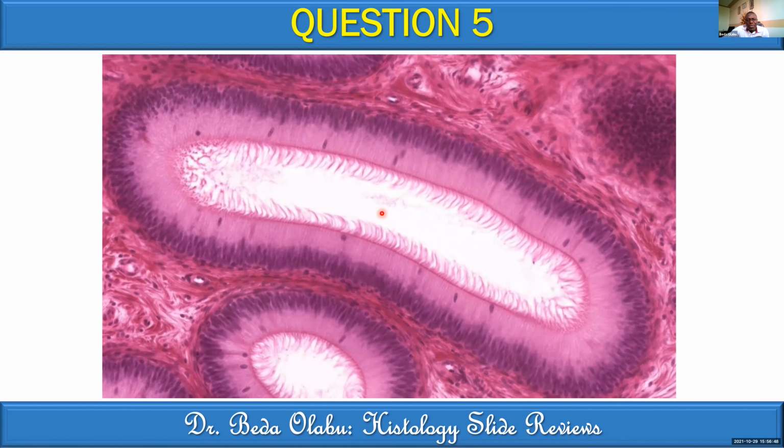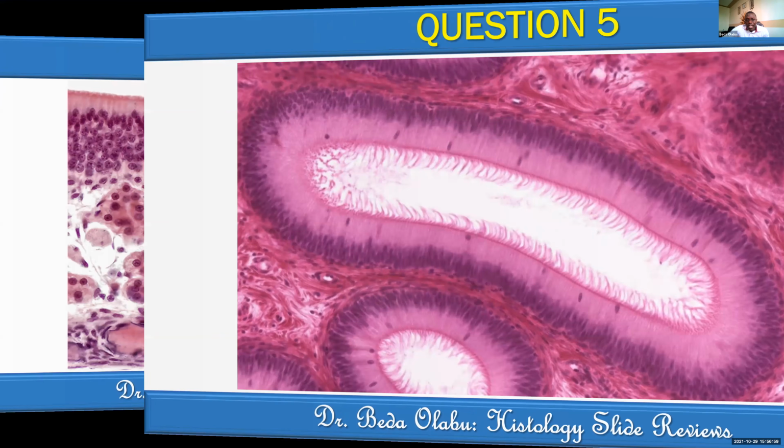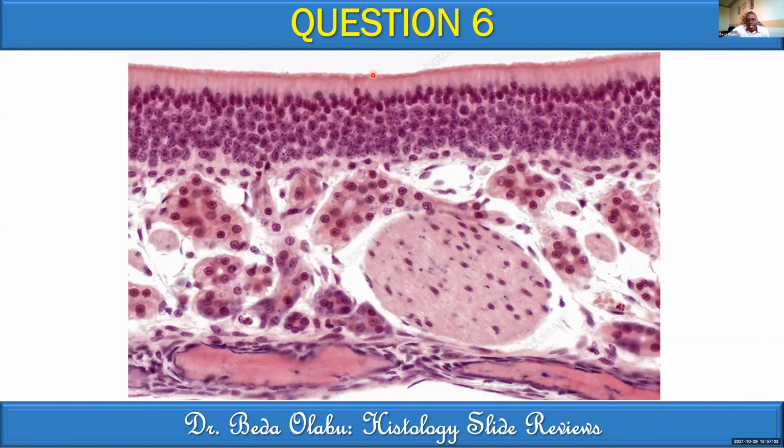Now cilia, depending on the age of the animal that has been sacrificed to do the slide, may really vary a lot, but generally it's filamentous. I am not so happy with mine here, but I think you've seen some cilia before, and perhaps you're going to see a better cilia in the next slide. This was a slightly older animal, and that's why the cilia there is crumbled. So Oscar, hope that is better for you. Yes, Doc, thank you very much.